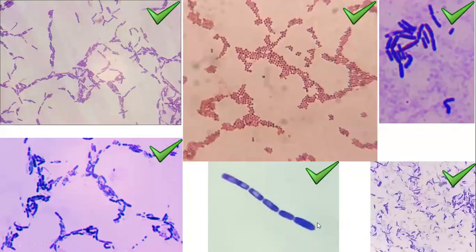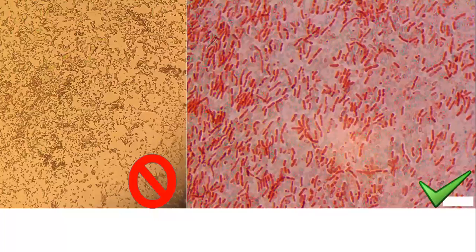You see individual cells here. They are very clearly gram positive cells. This is the observation you need to make. Again, I am very proud of one more student who shot this. Actually, this is from Carnobacterium. He has managed to pull it out very clearly.